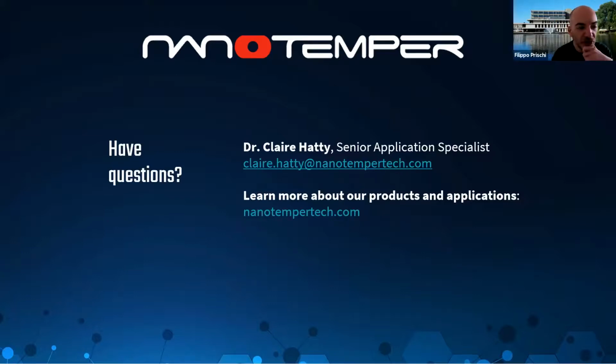When you use GFP, because I remember from the very beginning when I started working with MST, one of the first things I was told is to always try to use the red channel and avoid the others. How does GFP work from there?